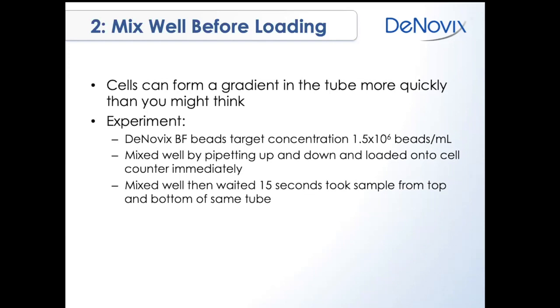Then we took that same tube, mixed it well, and then just waited 15 seconds. So kind of trying to mimic the amount of time that, if you got briefly distracted by a text message or somebody else coming into the lab and asking you a quick yes or no question, it might take. And then we took the sample from either near the top or near the bottom of that same tube.